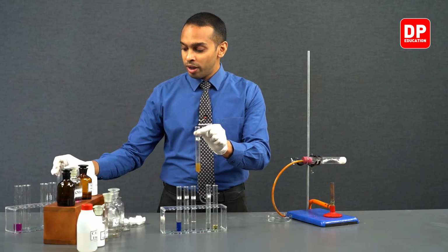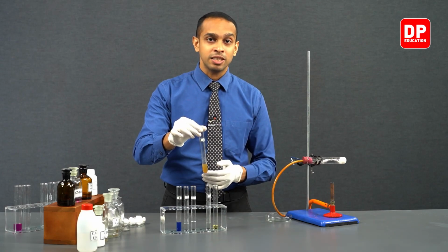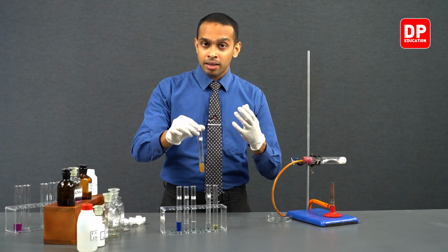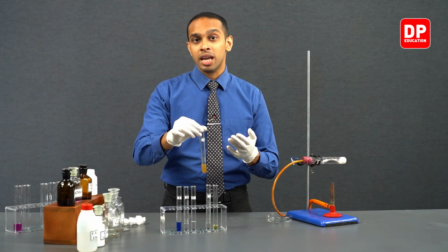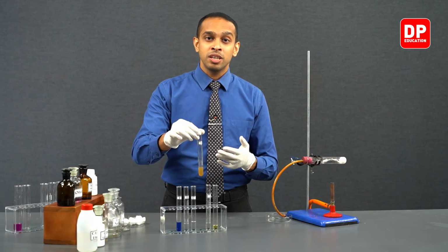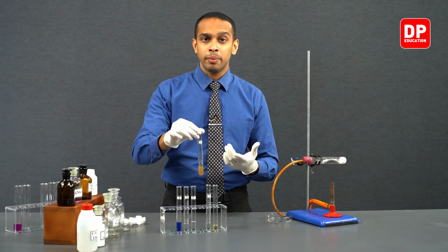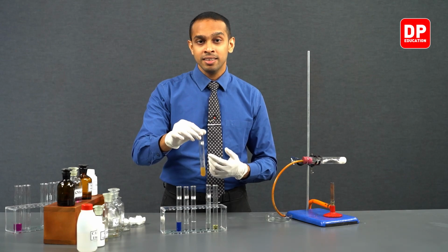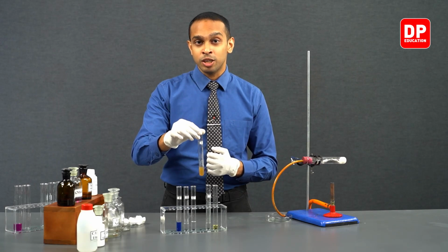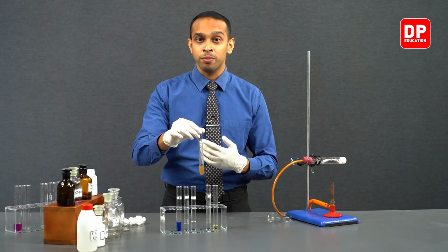But when we reacted this alkaline dilute potassium permanganate solution with ethene gas, the alkaline potassium permanganate was able to oxidize the ethene gas and produce diols, or a glycol. So across the double bond, two OH groups were attached, and this causes the ethene gas to get oxidized.